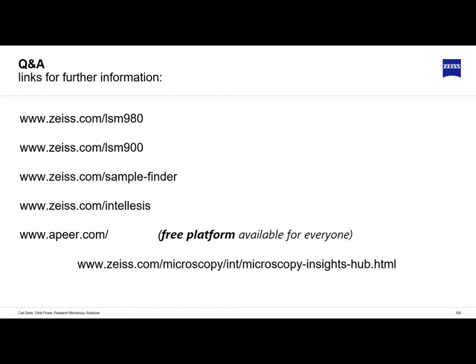So with automation, etc., one can improve reproducibility, but do the results improve? So meaning, will they be closer to reality? So let me get that right. As the results improve, will they get closer to reality? Perhaps I misunderstood that.